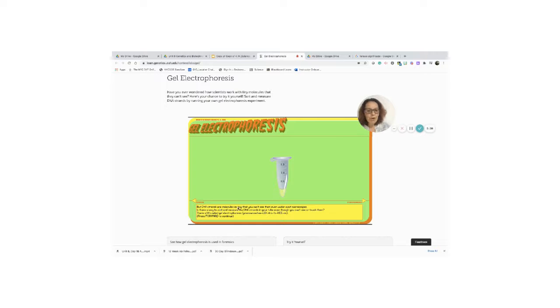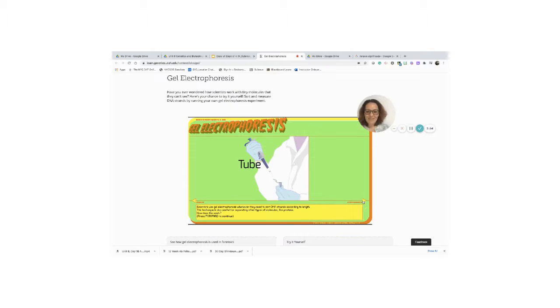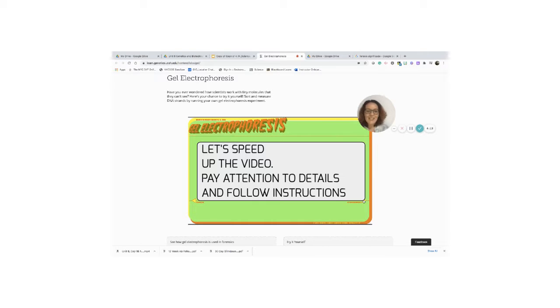But DNA strands are molecules so tiny that you cannot see them under most microscopes. Is there a way to sort and measure the DNA strands in your tube, even though you can't see or touch them? Yes, there is. It's called electrophoresis. Very good. Excellent. Let's do it. Scientists use gel electrophoresis whenever they need to sort DNA strands according to length. This technique is also useful for separating other types of molecules like proteins. How do they do it? Let's find out.